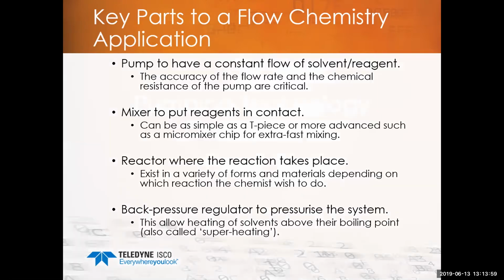Okay, so pumping technology. There are 3 or 4 different types of technologies I'd like to talk about here, and we're going to relate them to how they're applicable in flow chemistry. Then the next step is to talk about the key pieces of each of those technologies and see how it relates.